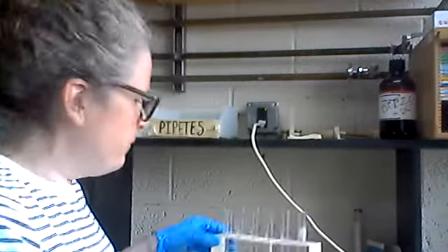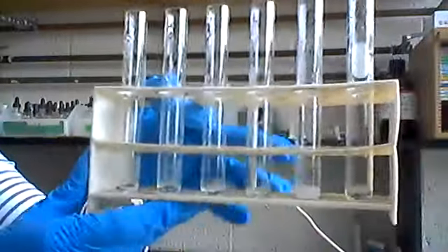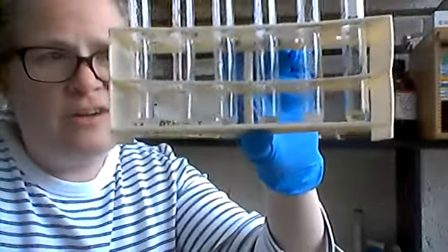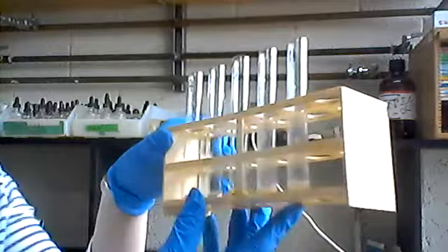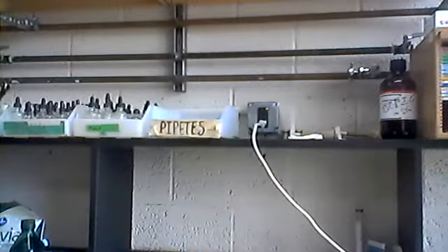All right, so I have pulled out the Lugol's iodine results here from their hot water bath. And you can see, if you remember before, some of them had turned that really deep dark blue. After heating, that is all gone. Even the yellow from the initial color of the iodine has all kind of gone away. So they're all kind of clear except for these that are cloudy that had kind of stuff in them. I'll show you the others. And again, I'll take photos of these and post those for you to see. Olive oil just looks like olive oil again.